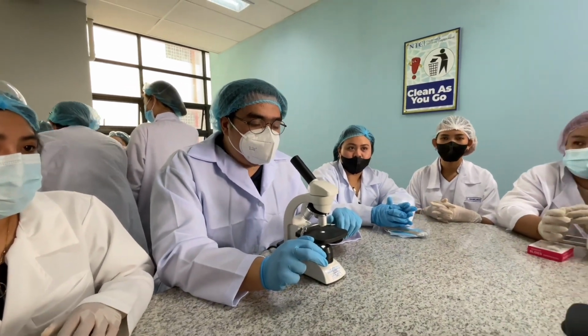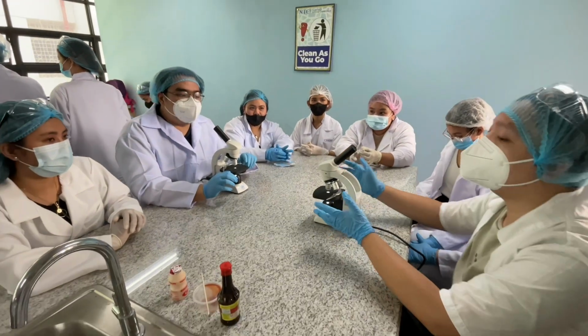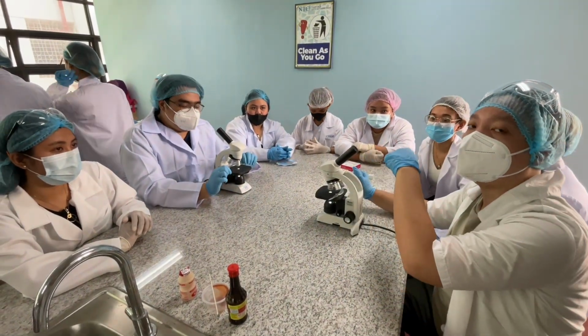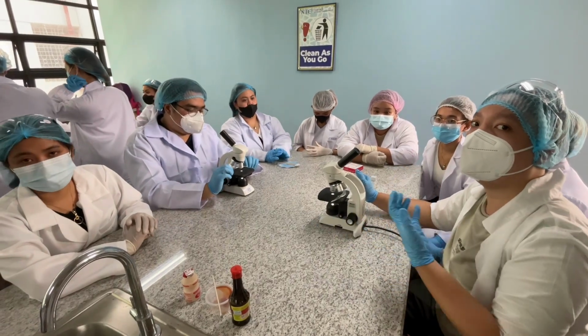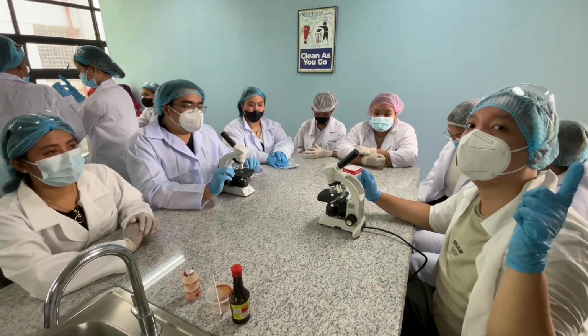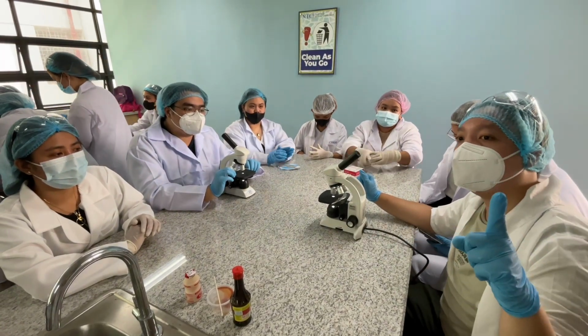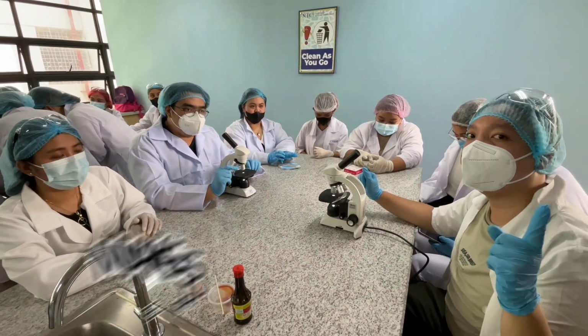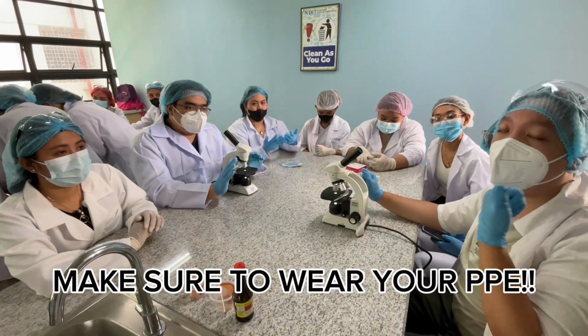So that's what we call the electric microscope. This afternoon, we're going to demonstrate what the functions are and how to actually use them in conducting our experiment inside the chemistry laboratory. And of course, just like our first video in the introduction, make sure to wear your PPE for our safety as well.